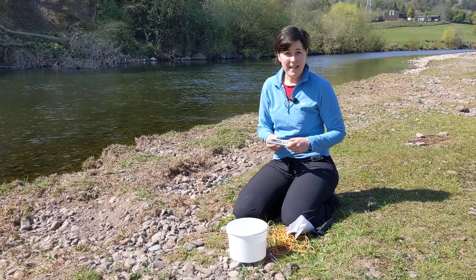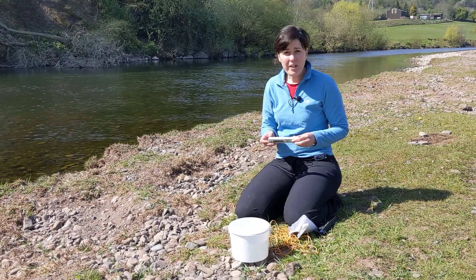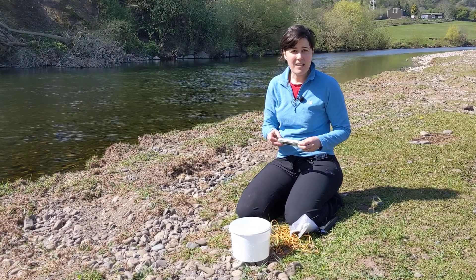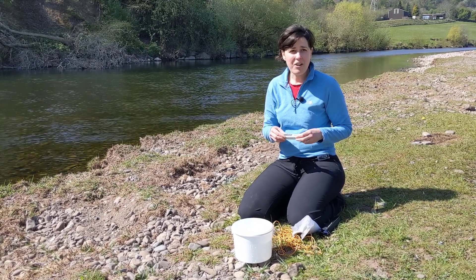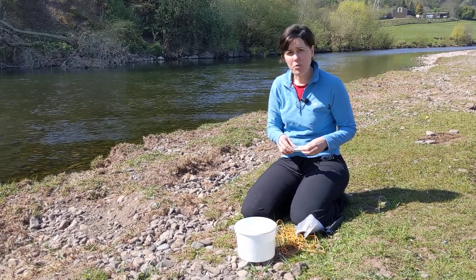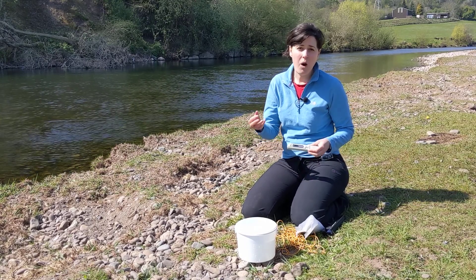To measure electrical conductivity and temperature in your sample, you have a meter like this. Electrical conductivity is a really useful measurement because it gives you an idea of the amount of stuff dissolved in the water. Electrical conductivity is a proxy for total dissolved solids — it tells us if we've got loads of ions in the water or not many.